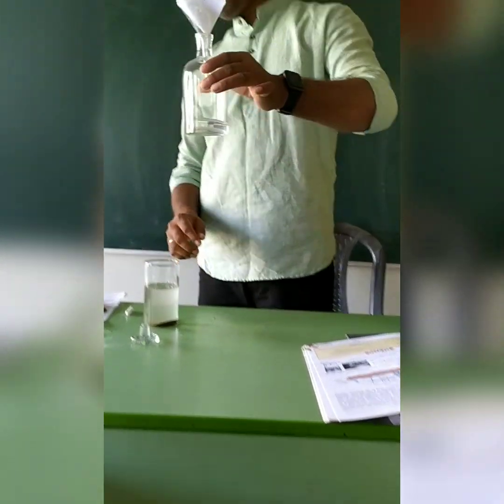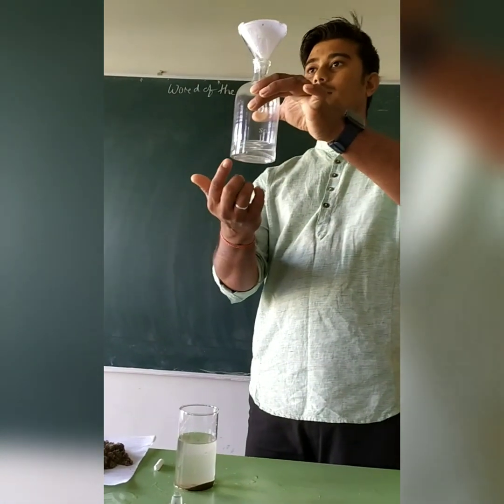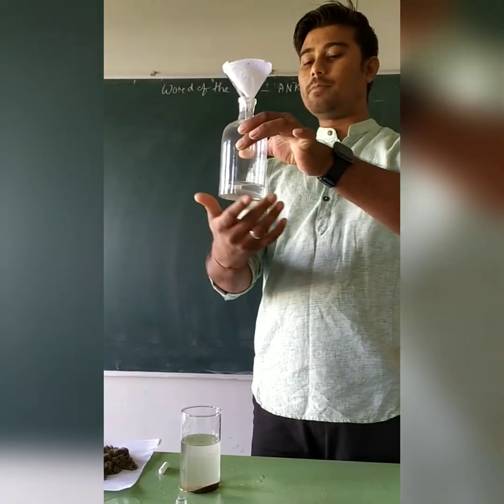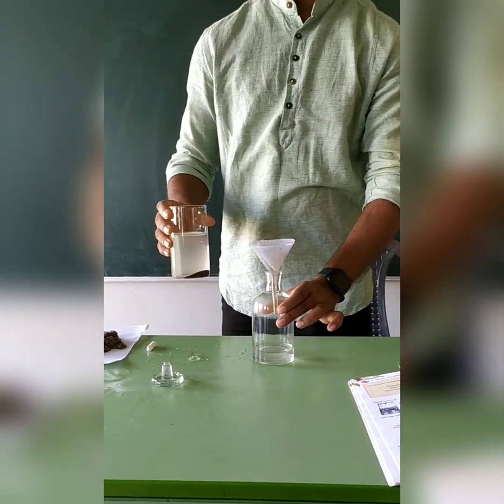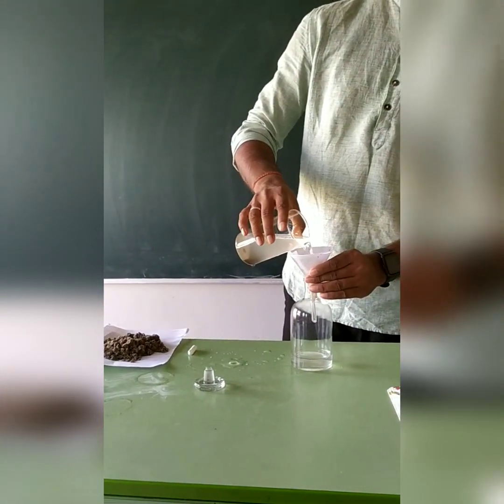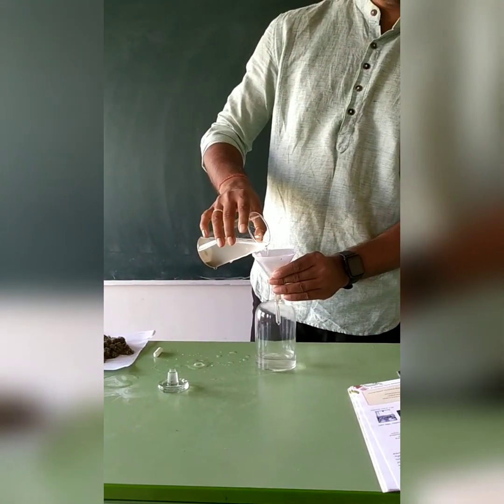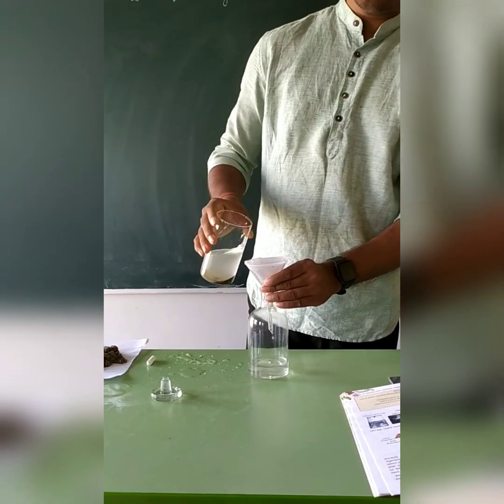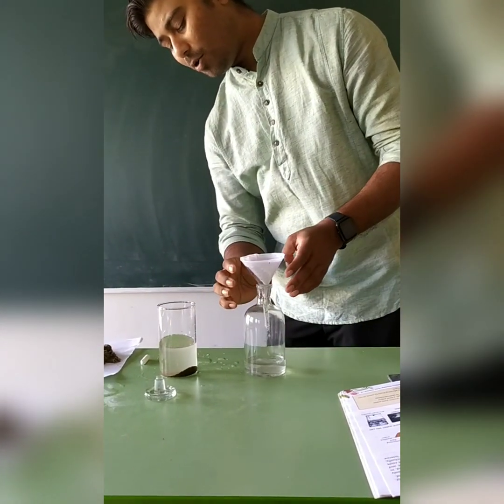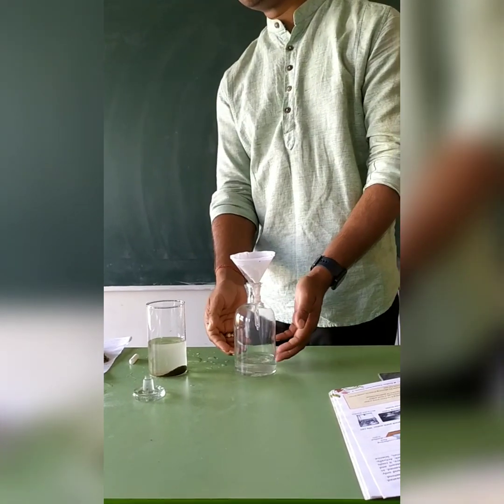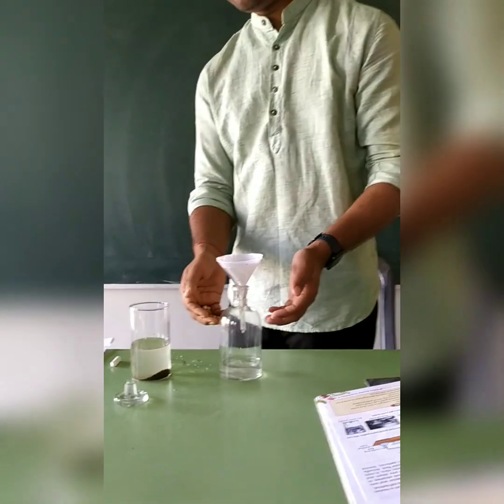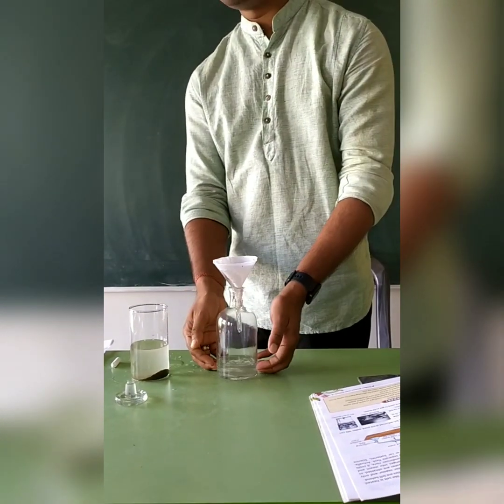This water is pure water. After filtration the water is pure water. So whenever we pour all the water here, slowly drop by drop all the water will fall down into the glass. That is the filtered water.